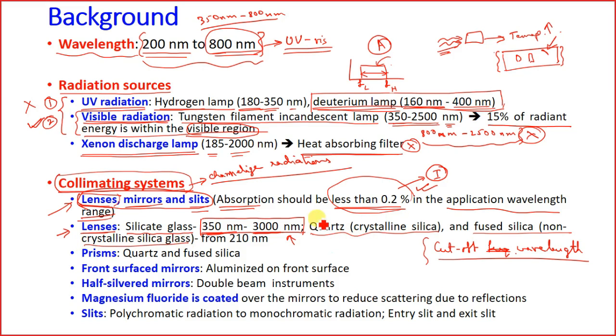What is the importance of this? If you look into this quartz and fused silica systems, you can work with them from the range of 210 nanometer up to 3200 nanometer.